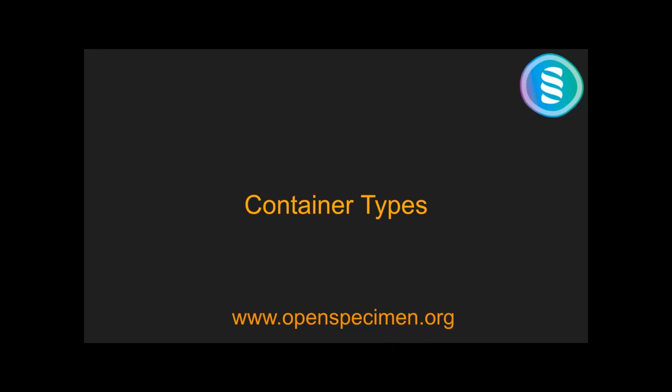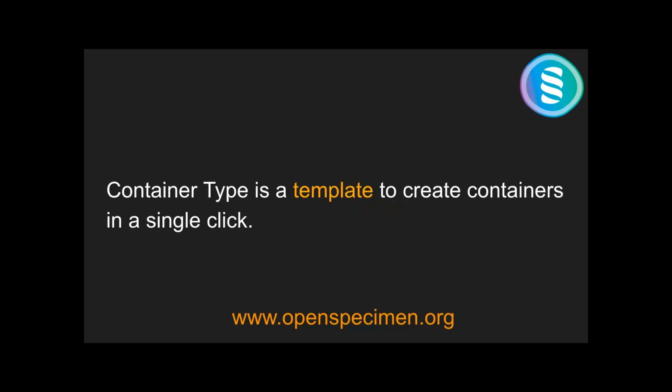Next is container types. This is one good feature that is supported by OpenSpecimen, and it is typically helpful for the majority of administrative users. A container type acts as a template that will be used to create containers with a single click.